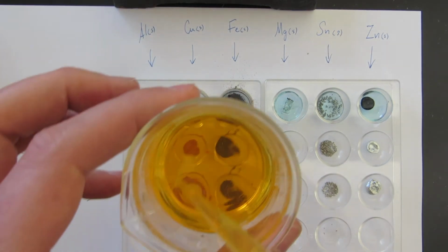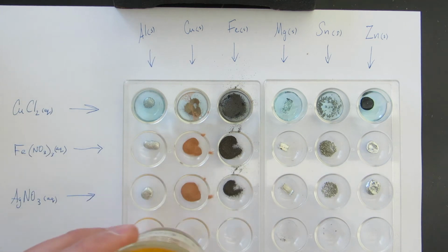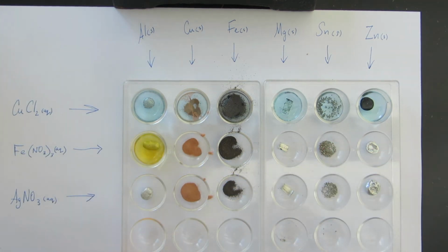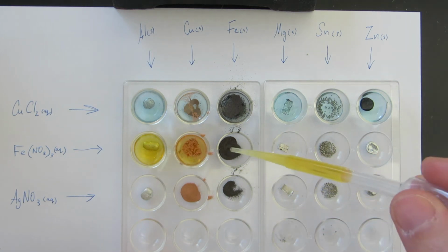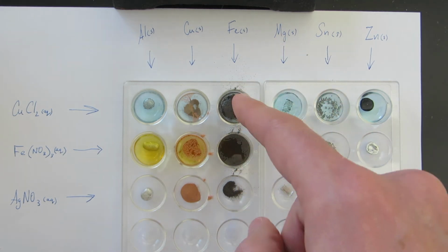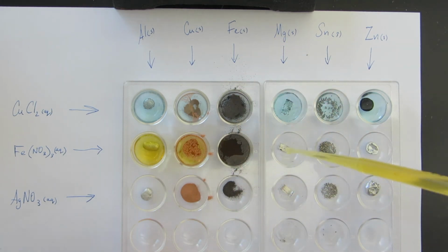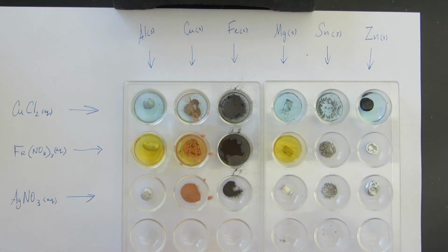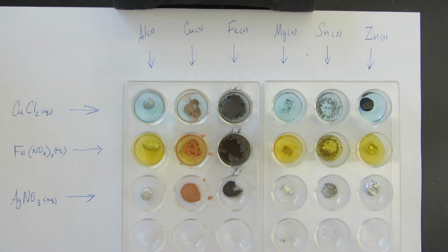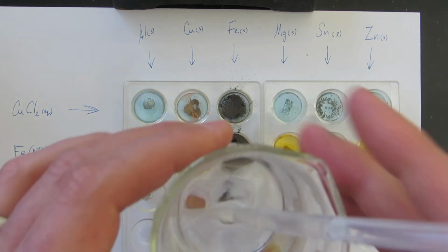All right, so here's the iron, right? Aqueous, right? We see through it. And I'll just add this to aluminum, copper. The iron in this column, it's really small particles. Okay, so there's iron everywhere. And last is the silver nitrate.